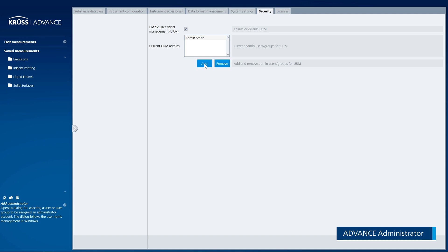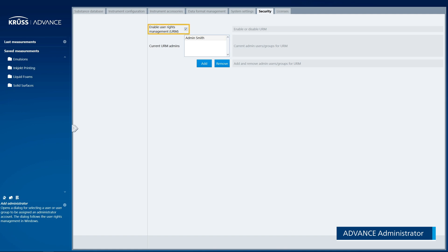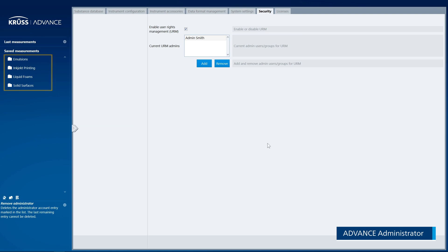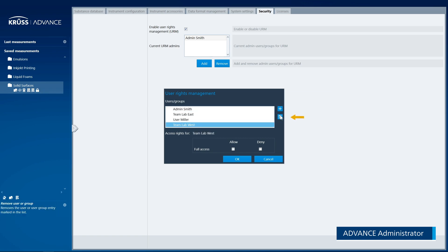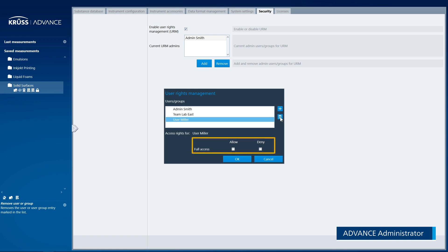Advanced Administrators are allowed to add and remove further administrators. They can also deactivate User Rights Management. As an Advanced Administrator, you are able to assign user rights to folders and measurements. Using the Supplementary button for User Rights Assignment, you can add and remove users or groups and edit their access rights.